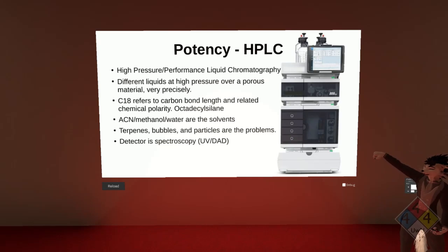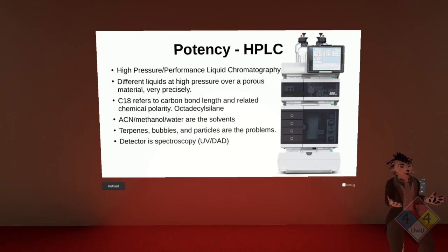And then we have terpenes, which is an interfering compound with cannabinoid analysis. So again, it's going back to that this is a dirty biological matrix, so other things that are in the biological matrix interfere with your attempts at quantitating your analytes of interest. In this case it's the potency, so the delta 9 versus THC-A versus, let's say, delta 8 or CBDV, CBC, all the other cannabinoids.